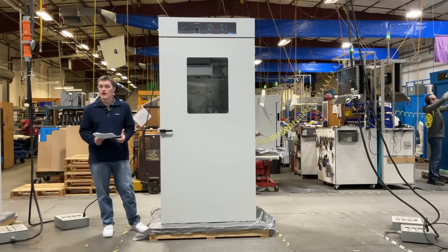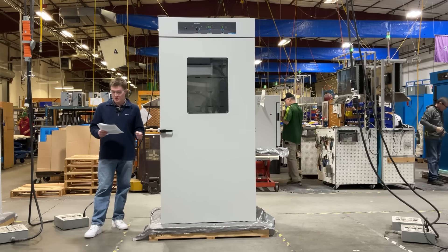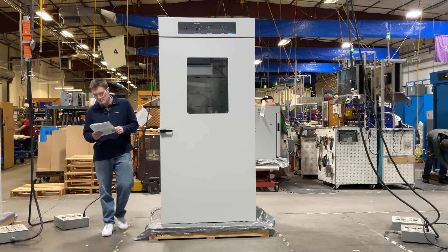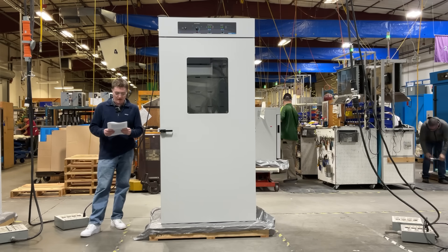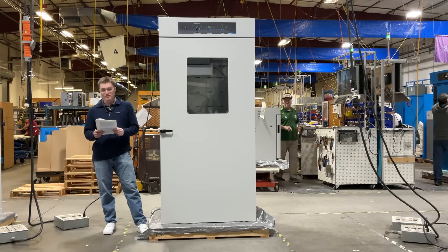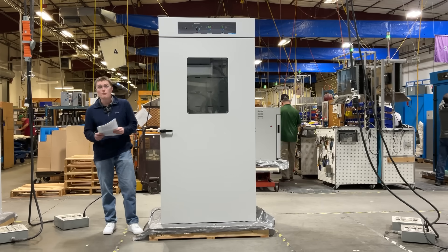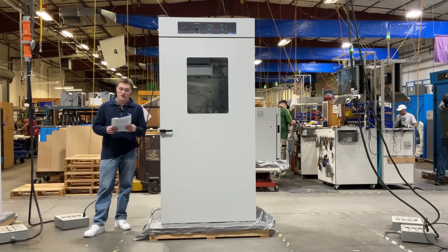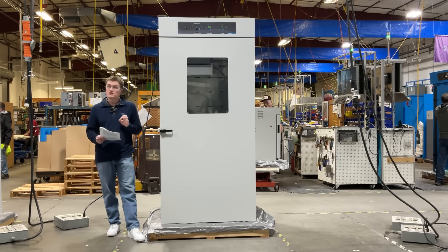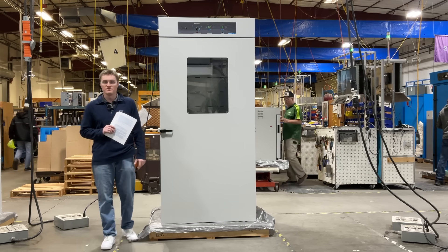The versatility of the Shell Lab SCO40 Large Capacity CO2 Incubator makes it ideal for a wide range of applications. In cell culture labs, it provides a controlled environment for the culture of mammalian cells, crucial for medical research and pharmaceutical development. Microbiology labs benefit from its precise control features, fostering the growth of bacteria, fungi, and other microorganisms for study. Research labs across various disciplines rely on the SCO40 for experiments requiring stable environmental conditions, making it an indispensable tool for scientific discovery.